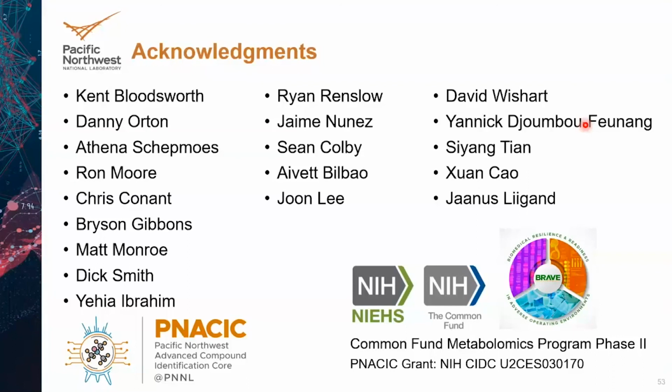It'd have to be some well-characterized sample that's maybe handed out to all the different laboratories, and we all participate in a ring trial or other type of interlaboratory comparison, and we provide the results, and hopefully one or more different methods will generate many confident metabolite identifications with associated low false discovery, and I expect everyone to switch over to using that.